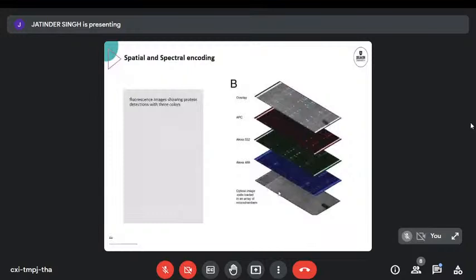So we have a microchamber with two different cells being loaded in, and different antibodies or excreted proteins can be measured, with the characteristic strips just like in the previous paper. The cool thing here is that they also measure the location of the cells. If this cell was creating something that this one liked, they got closer together. If that was not the case, they stayed stationary or moved further away, which allowed for studying cell to cell communication, because this cell may get a signal from that cell to get closer and get more communication going. So you can see cells start off reasonably close, then drift further and further apart because they're telling each other something that means they don't want to be together.